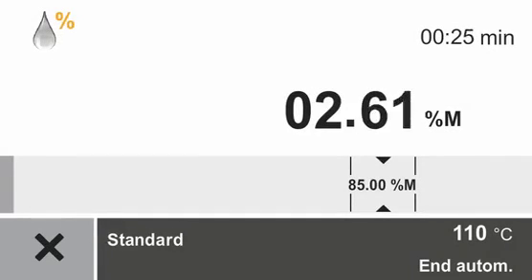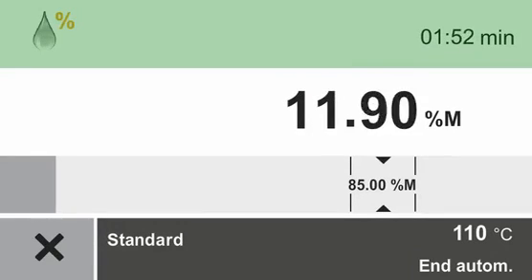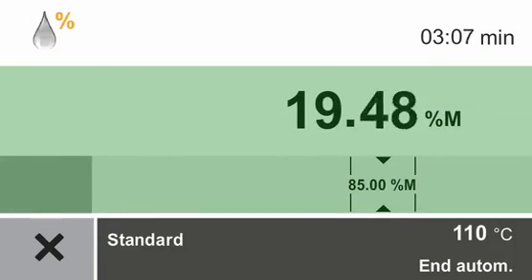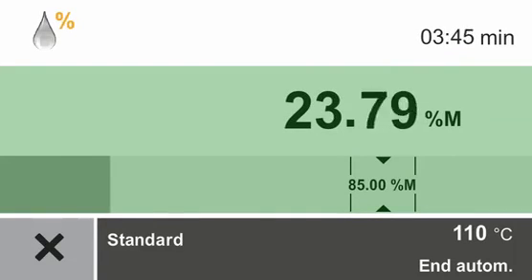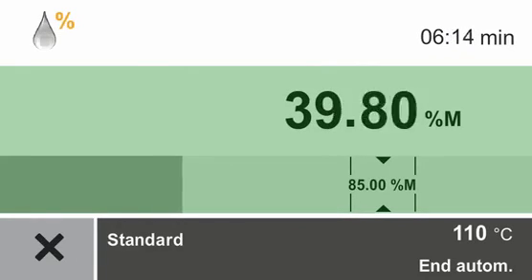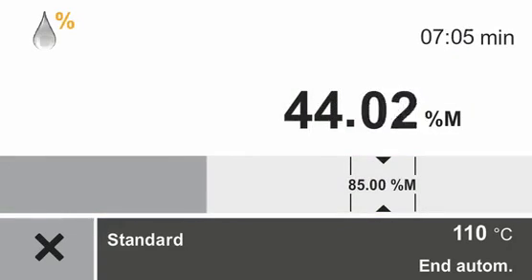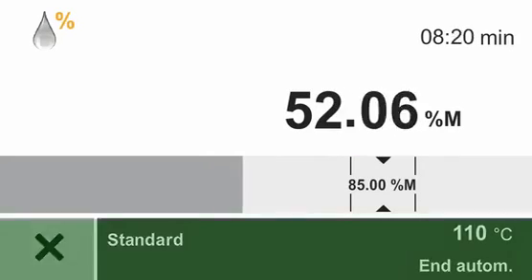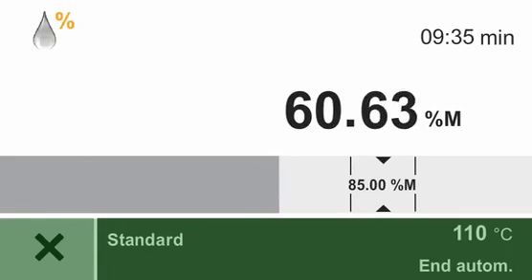You will be able to pursue the course of the moisture determination in the display. In the information bar at the upper section, you will see the actual duration of the measurement. In the central region, the actual measured value, including measuring progress, is displayed. If the target value is known, the measured progress is indicated by a bar; the target value is highlighted and the tolerance limits are indicated underneath the actual moisture content. If the target value is unknown, the measurement progress is represented by a curve chart. In the function bar at the bottom, you will see information such as the target temperature or the shutdown criteria.